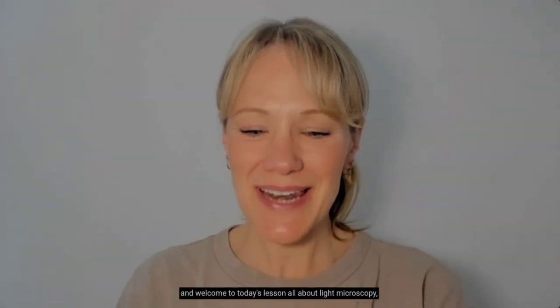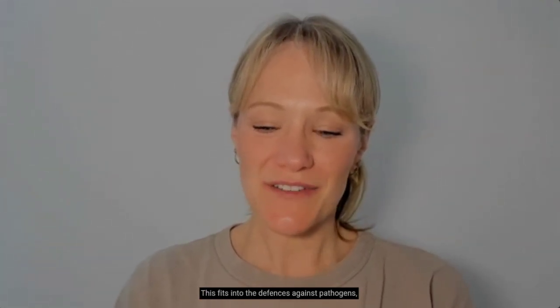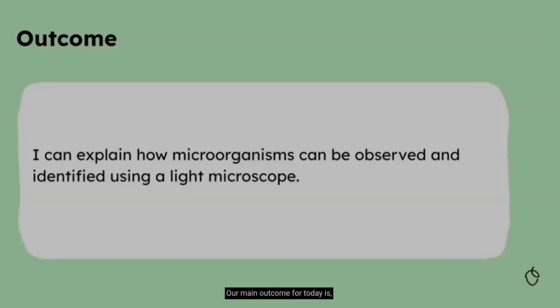I'm Mrs. Kemp and welcome to today's lesson all about light microscopy, observing and identifying microorganisms. This fits into the defences against pathogens, the human immune system and the vaccination unit. Our main outcome for today is I can explain how microorganisms can be observed and identified using a light microscope.